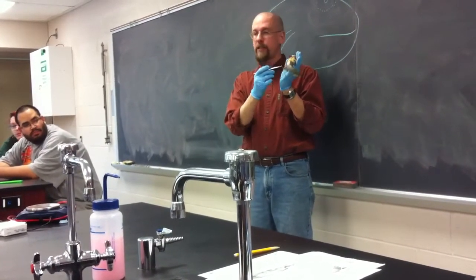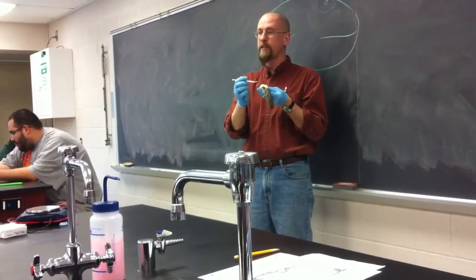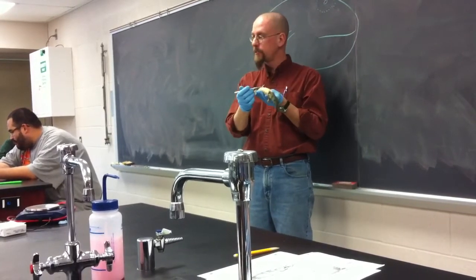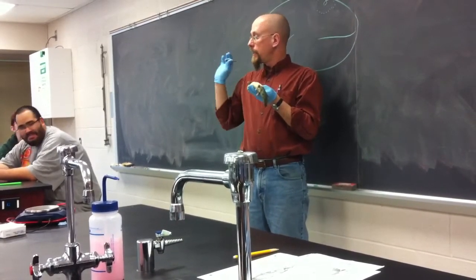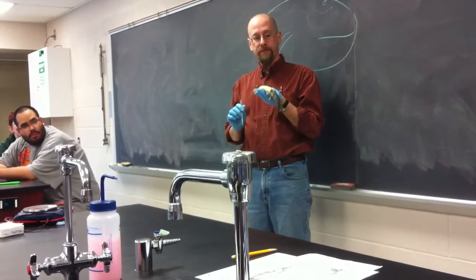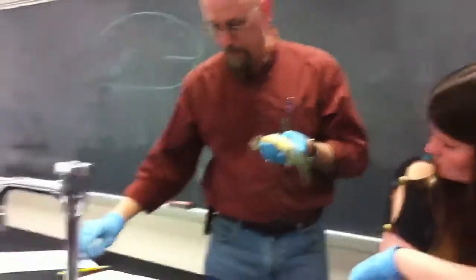Now below the transverse septum, you have your external obliques. The hypaxial muscles you can see are the external obliques. Then it has you look for the internal obliques and the transverses. There is a diagram in your packet.